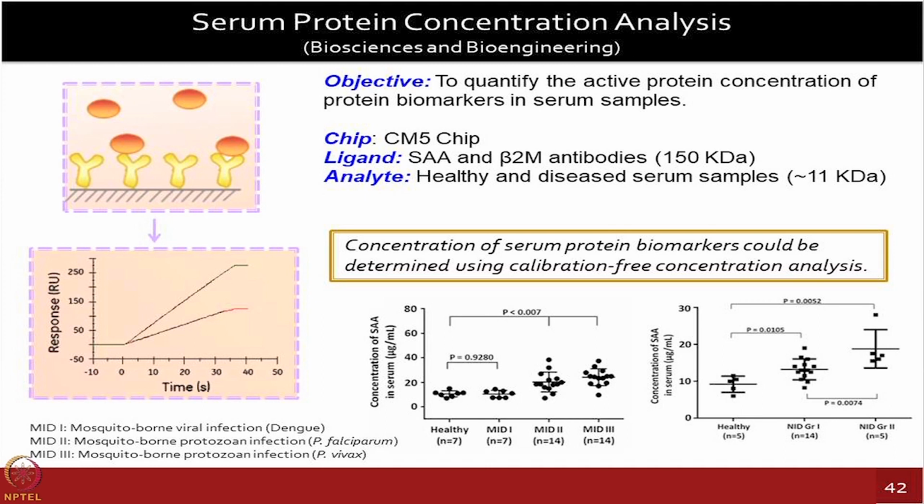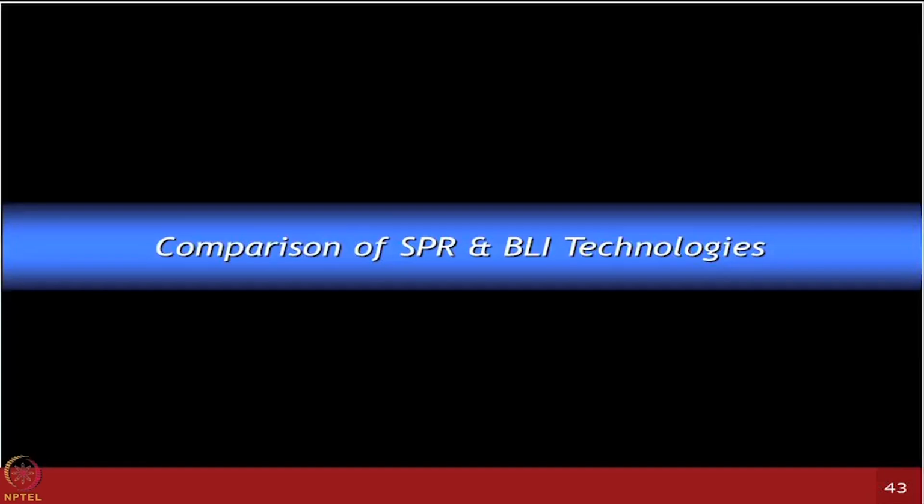This is what you need. You cannot do validation on a large number of samples using mass spec or other types of technologies. So you have to come down to either ELISA or these label-free approaches, which can do screening of the same molecules in a very high throughput manner. This was a good experiment for us to show that we can actually measure the concentration of this protein of interest. Sometimes you have to develop these assays in the beginning, so you need pure protein. It's a good idea to try out something if you are planning these kinds of experiments with known proteins for which you have purified proteins available. Build the confidence and the assay conditions from those, then you can apply them to unknown compounds as well.